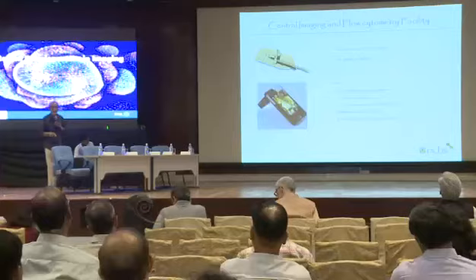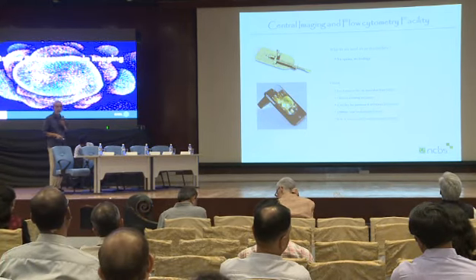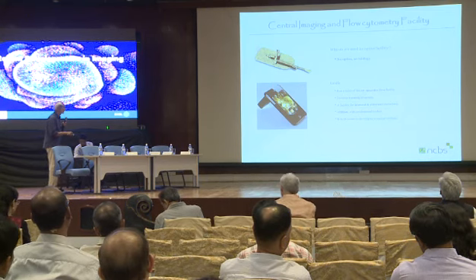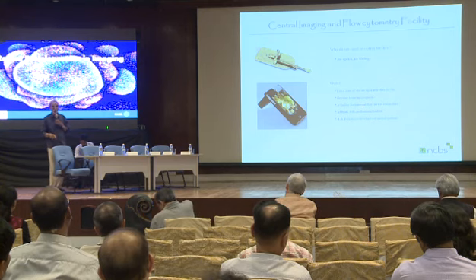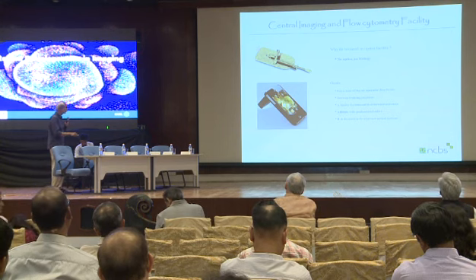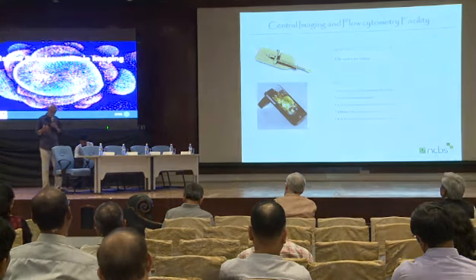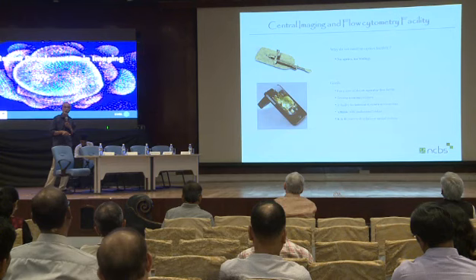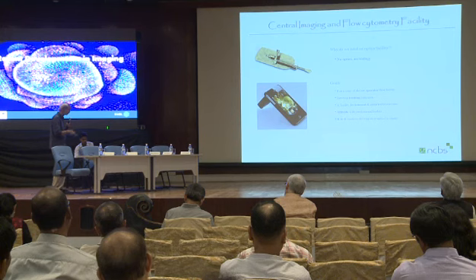That was our goal. To have this operator-free facility, we need a strong training program. There were no training programs at the time, so it took a good 1 or 2 years to develop them. Our goal was to have the facility for both internal as well as external users. We were not greedy by any means. Then we affiliated our facility to professional bodies. Our facility is affiliated to ISAC, the International Society for Advancement in Cytometry, and also to the Eurobioimaging and Global Bioimaging partners. So it is associated with many professional bodies.